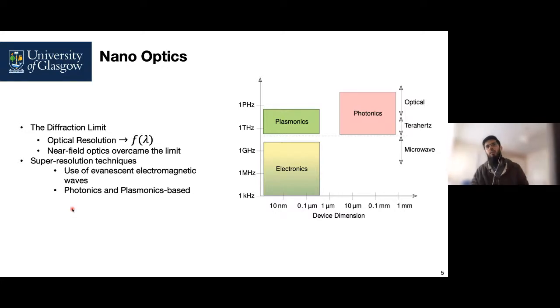With the development of advanced fabrication techniques in the last 20 years, we have been able to manipulate light in ways that have not been possible in history. So we have seen the emergence of new sciences such as photonics as well as plasmonics that help us manipulate light, which in turn can also be translated to the development of precise and super high resolution imaging of microscopic devices.